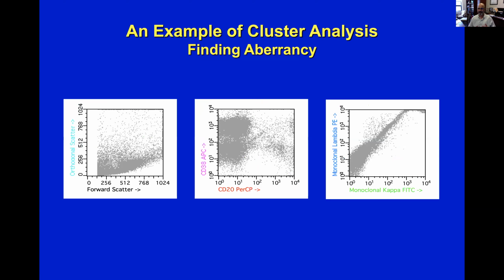So before we go there, this is a case that was developed by my dear friend Steve Croft. We were both at UT Southwestern together. We drank the Kool-Aid of cluster analysis that was brought to that institution by Louis Picker a long time ago. So a quick case: here's a bone marrow specimen that has come in for an evaluation of lymphoma. Is it a stage 4 lymphoma? Is bone marrow involved? Basically, that's the question.